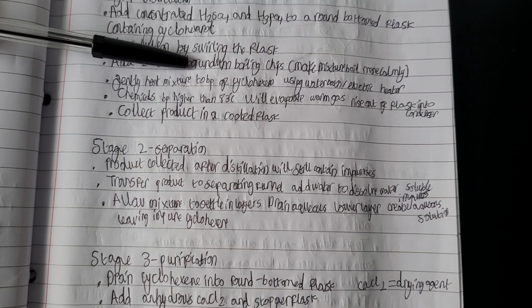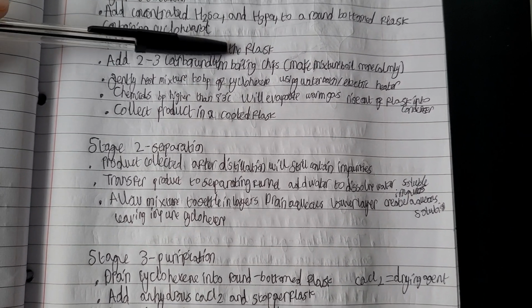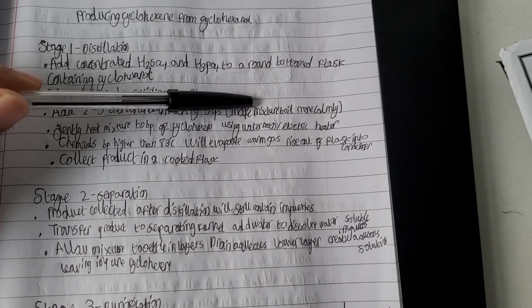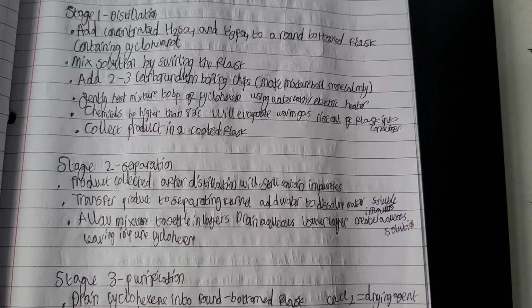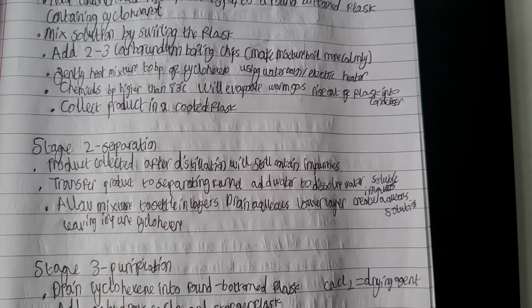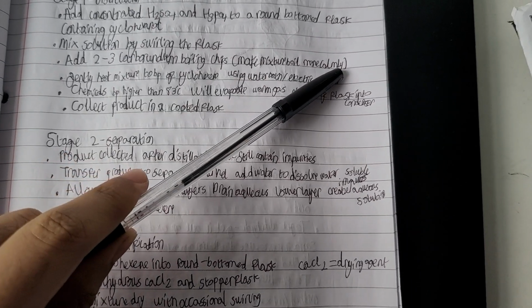How are we going to mix the solution? By swirling the flask. And then we want to add 2 to 3 carborundum boiling chips. The reason we first mix the solution by swirling the flask and then add 2 to 3 carborundum boiling chips is because these chips make the mixture boil more calmly. Because think about it, you don't want vigorous bubbling, vigorous boiling. You want it to be a calm reaction, so you're not intimidated by the idea that you might get hurt. So you add these boiling chips to make the mixture boil more calmly.